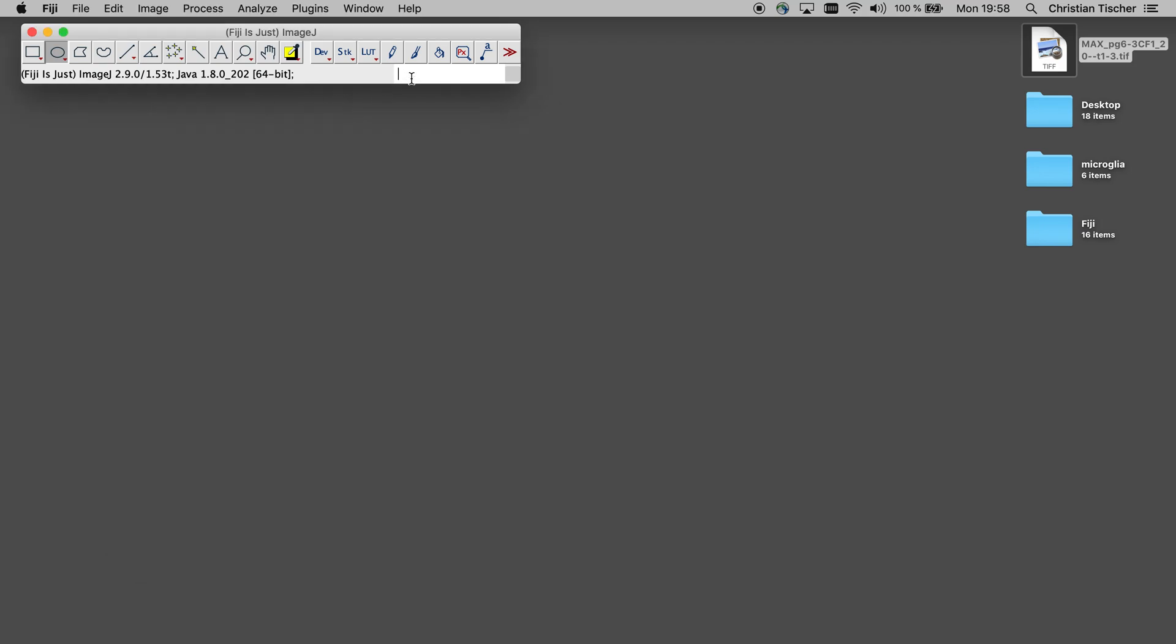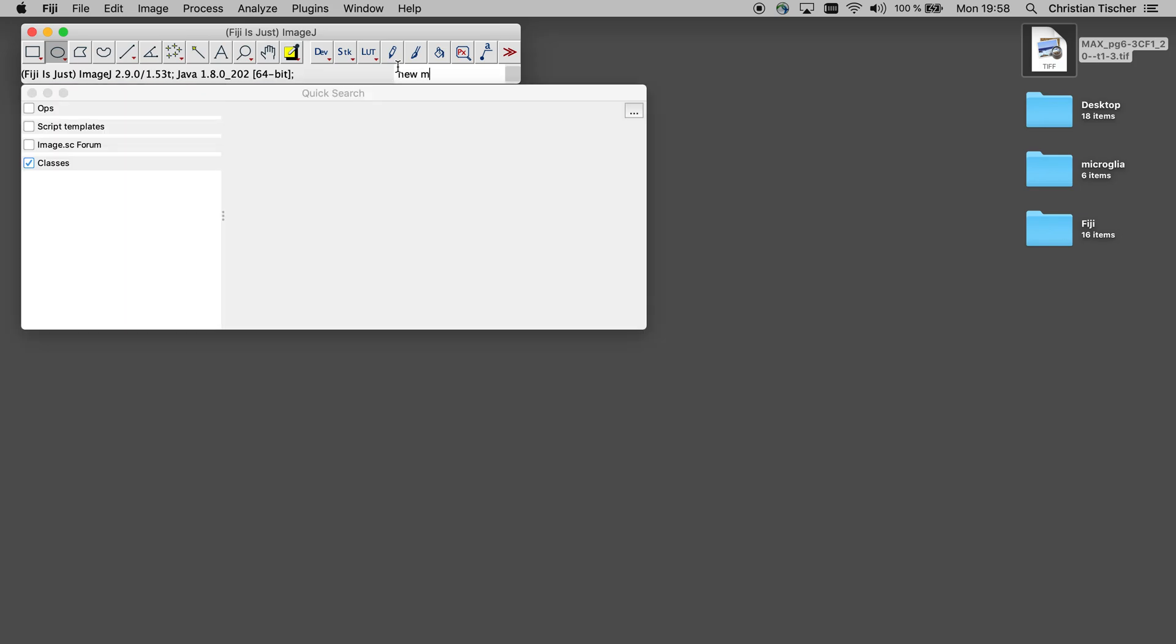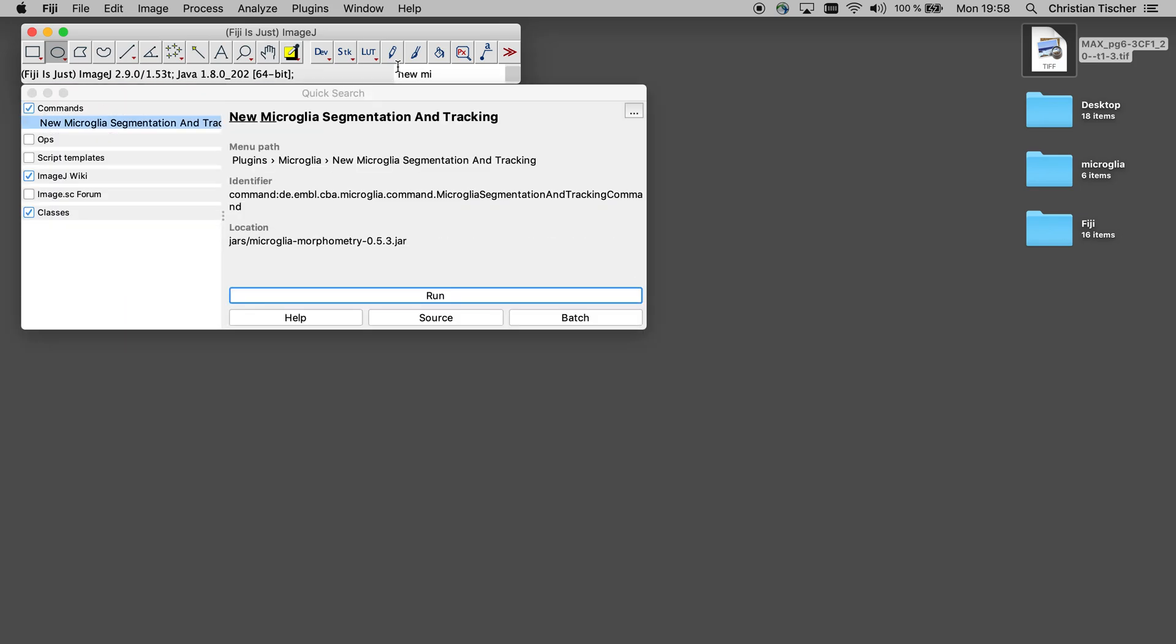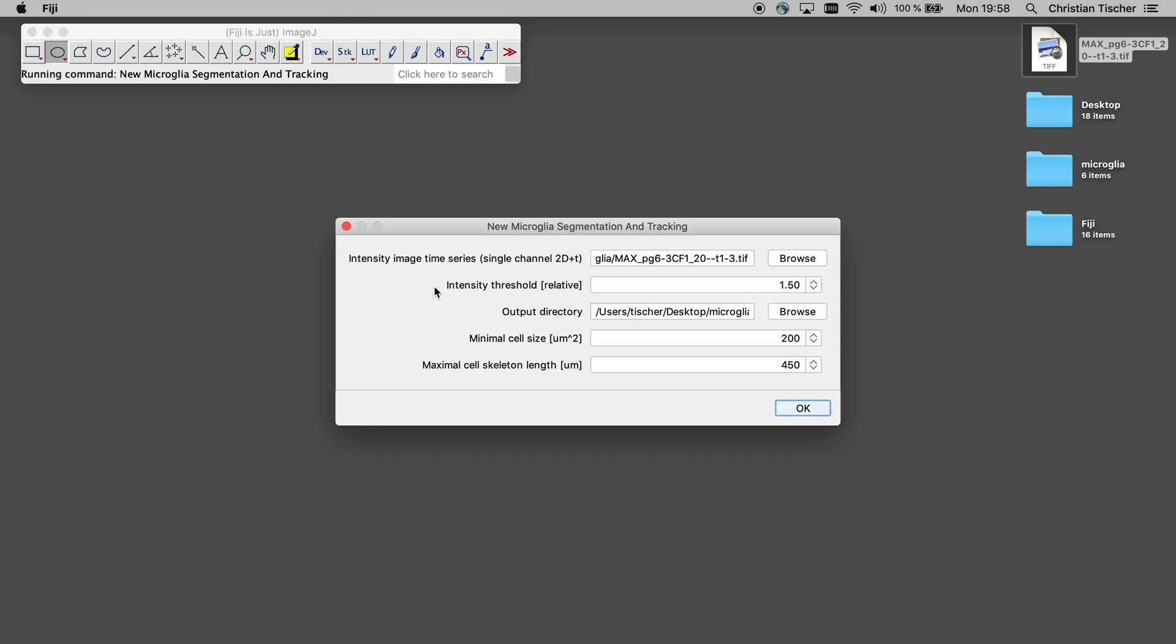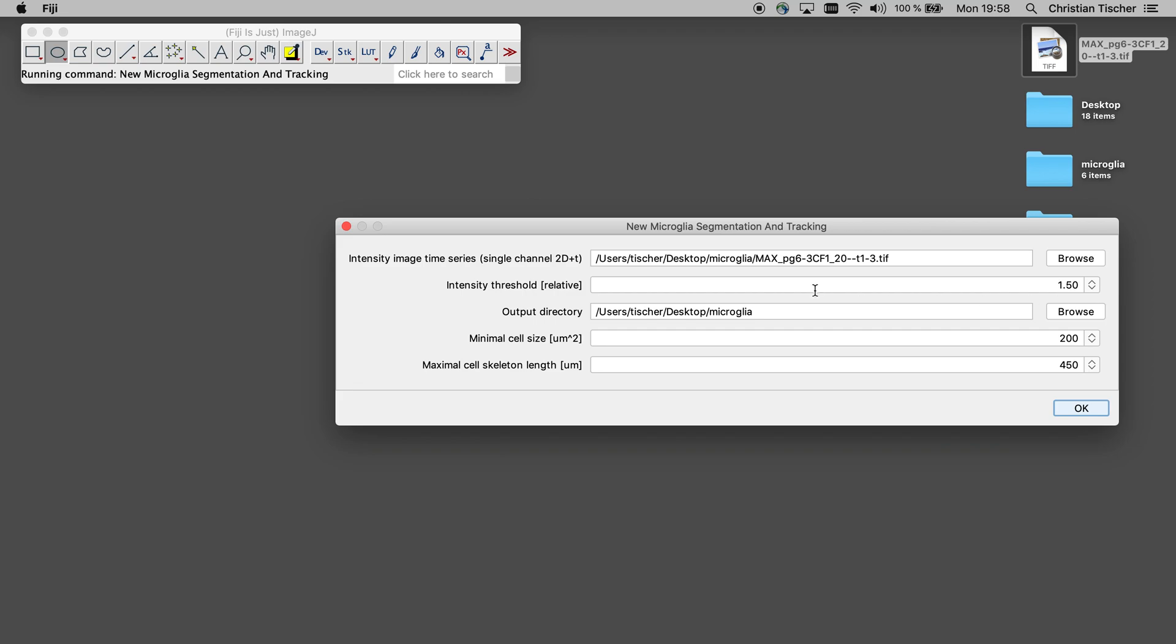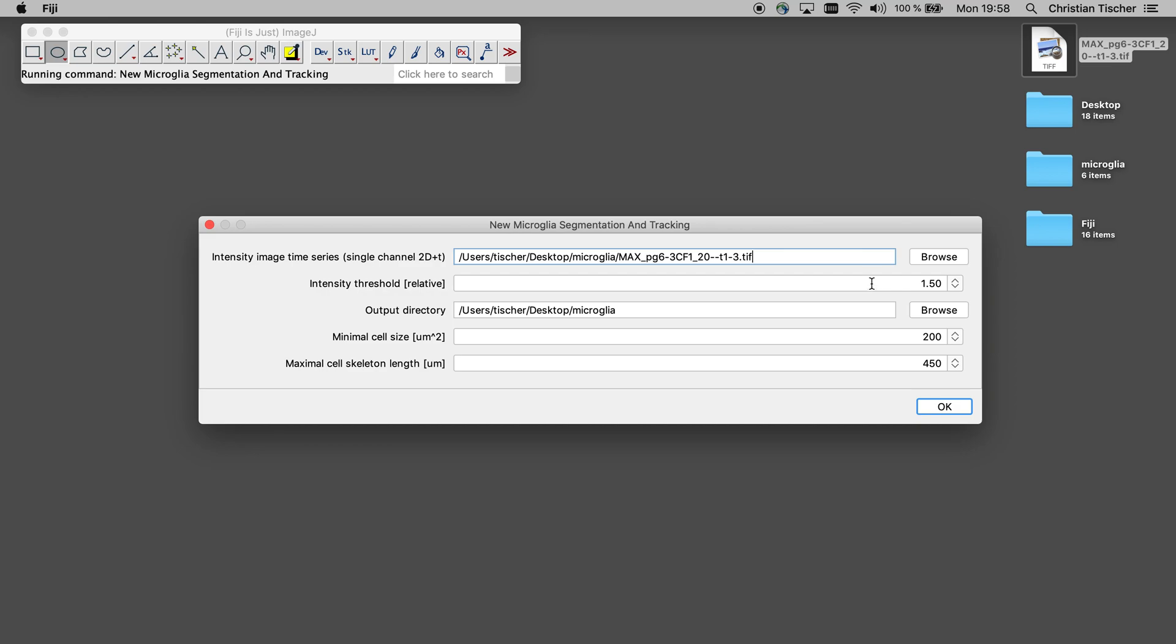So let's run it. The new microglia segmentation tracking can be also found here in the menu. I'm pointing to the file that I just downloaded. Here's a threshold. This is intensive relative to the intensities in the image. So if your microscope settings change in this respect, you could still leave that threshold the same.